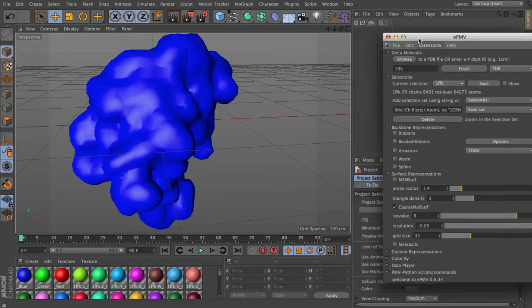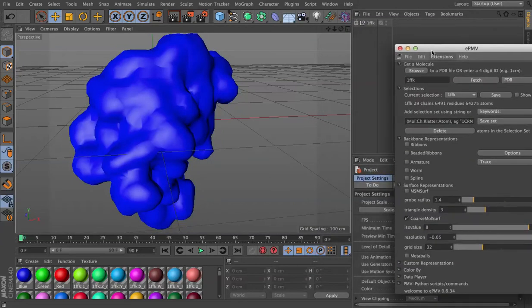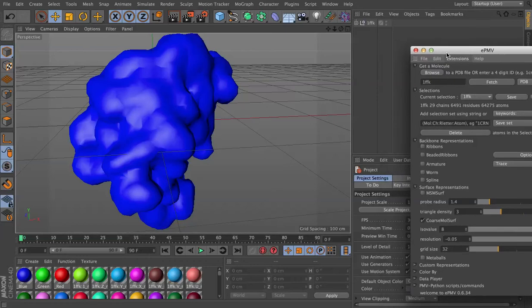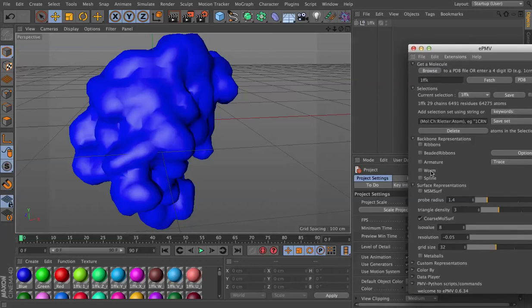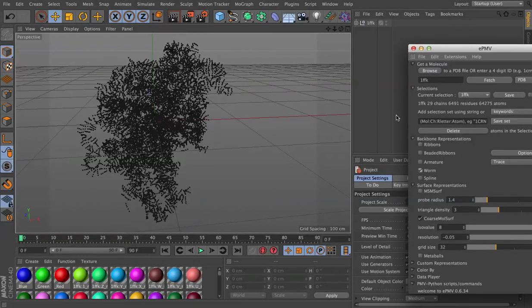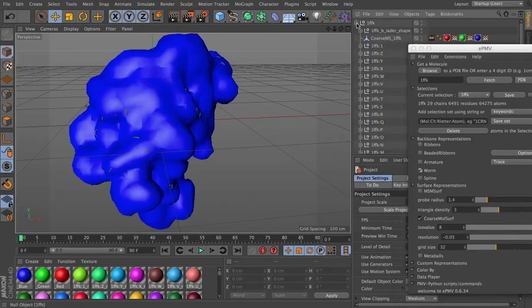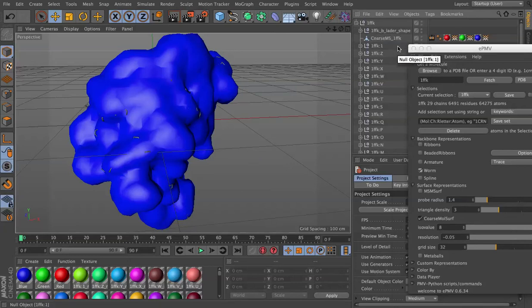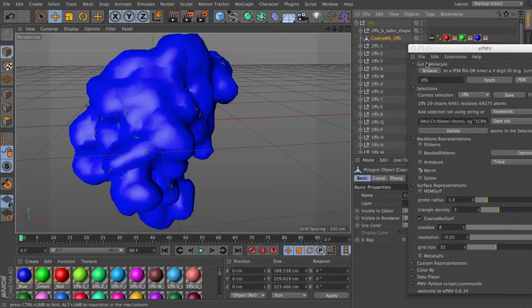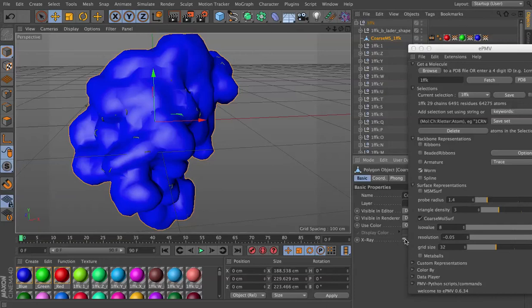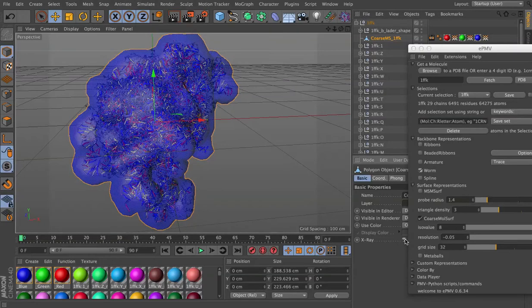And again, we can turn on the worm representation to see how well it's fitting to the original structure. And I can turn on x-ray for that surface. So we've got nice coverage there.